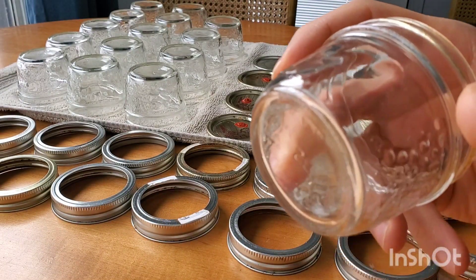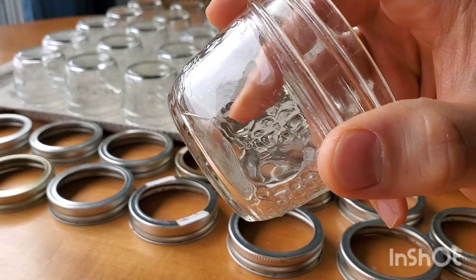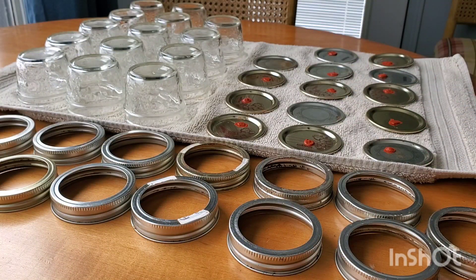Also, you want to inspect all your jars to make sure there are no cracks. As you can see, there's a crack in this jar here, and we will not be reusing that because there's a good chance it's going to break when we pressure cook it. Enjoy and best of luck!